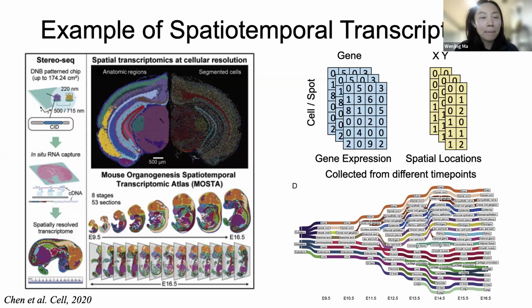Yeah. I will definitely show that, for example, in the later real data analysis, we will show certain domains might disappear because of the limitation of the spots that can be measured by the 10x Visium. But I just want that to give you a clue. Thank you so much for the question.